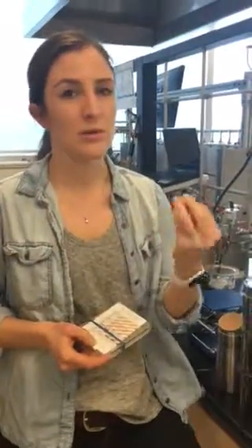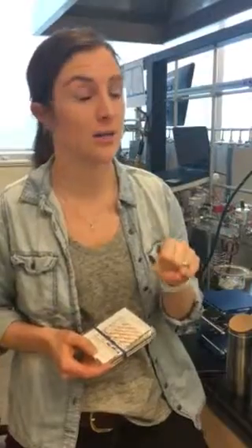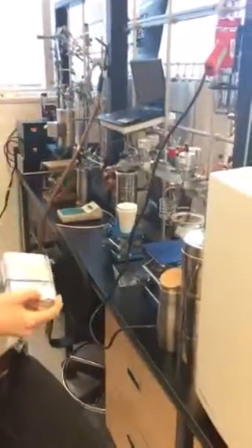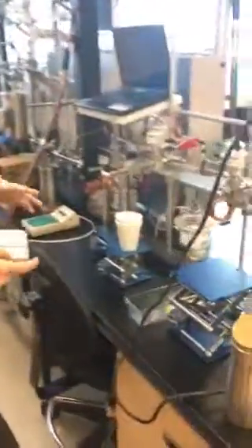The carbon is going to adhere to iron powder, and if there's sulfur, then that sulfur is going to take that spot instead. So we make sure we get rid of the sulfur, we remove the water using a water trap, and then the clean CO2 comes out here on the other side. This is a little bit confusing because we're also just doing an experiment right now with combustion of methane, so we've got a lot more set up here than we normally do.